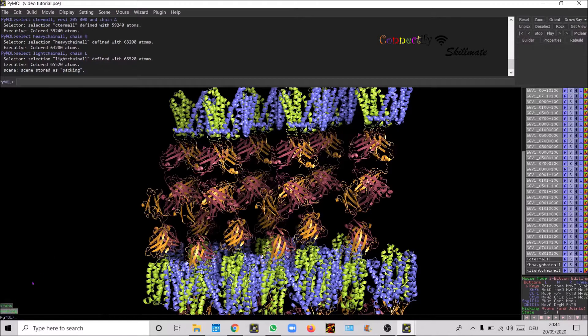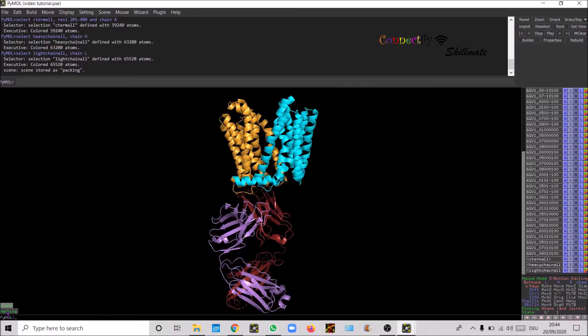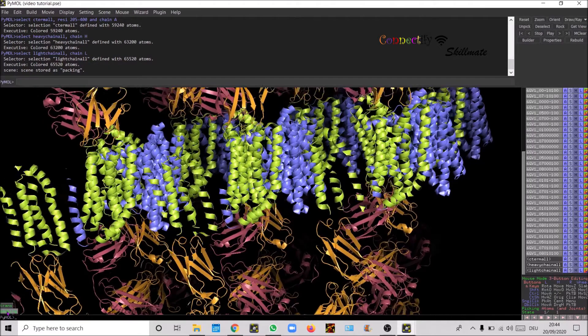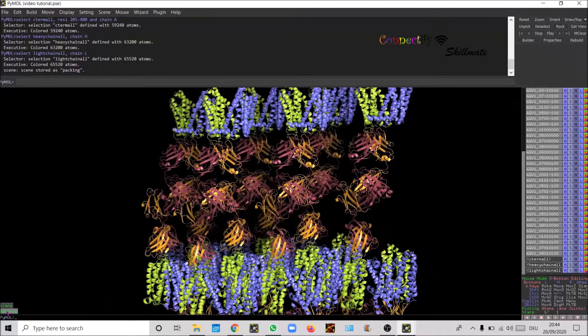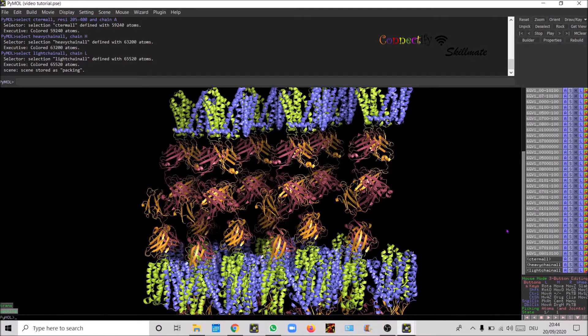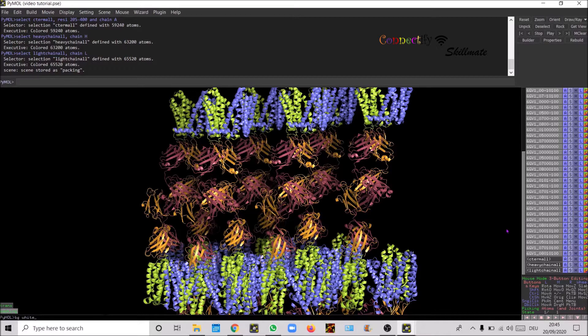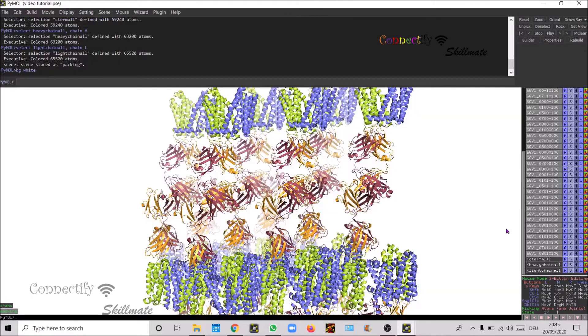So now this is selected to raspberry. I'm gonna tilt it a bit and then update the scene, scene of the trans and the scene of the packing here. Now you can change the background to white, BG white.